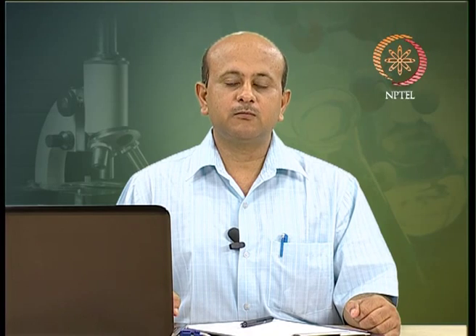Now, we see there is a growing realization of the need to perform structural studies under the conditions in which proteins are actually operating, that is, in solution, as well as under other conditions, and to provide measures of the rates of structural changes of proteins, which are often essential to their biological function. If you recall, in the previous lecture we were talking about infrared spectroscopy, which to a certain extent helps in providing structural information. But circular dichroism has a lot of different parameters that could be used, and a lot of different conditions you can work around and get a lot of useful information.